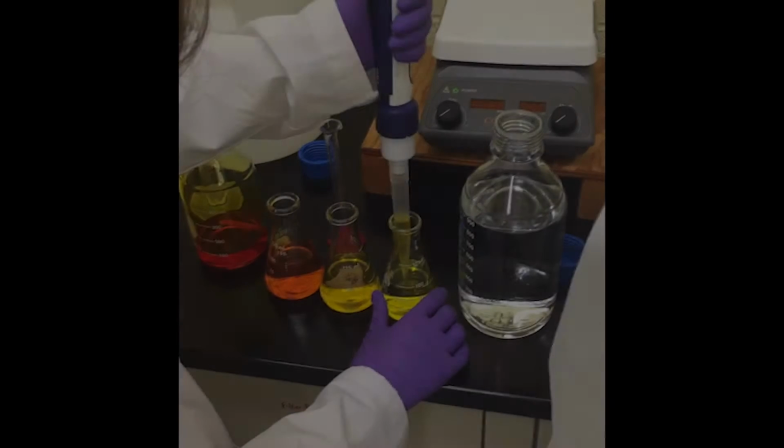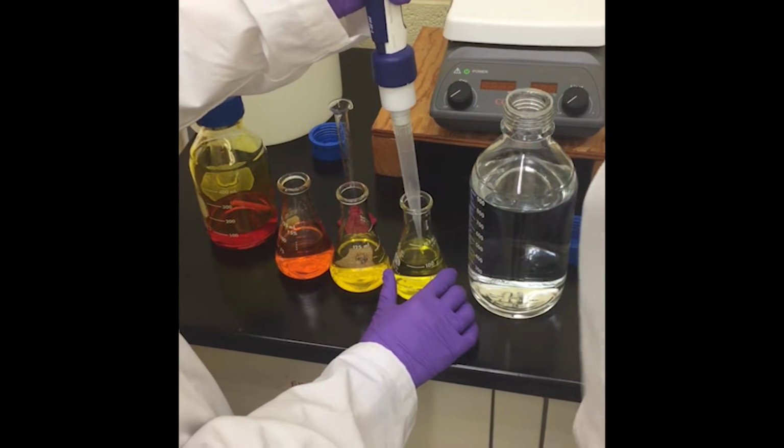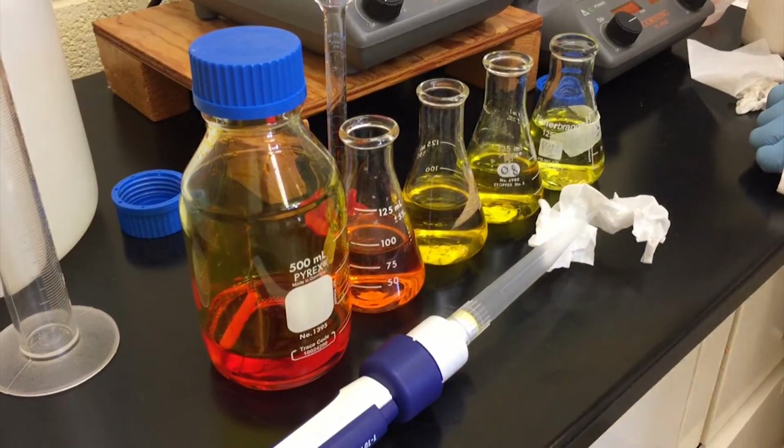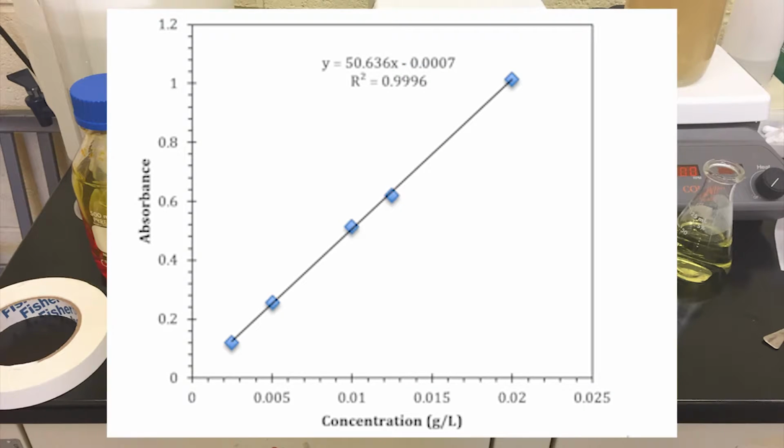To calculate the concentration of tartrazine dye released into the water bath at a specific time in the experiment, a calibration curve was created using known dilutions of the tartrazine stock solution. Various dilutions were created until absorbance readings were measured on the spectrophotometer ranging from 0 to 1 to demonstrate a range of viable concentrations. Using these readings, a linear trendline was generated, enabling us to directly relate the measured absorbance of the beaker solution to the tartrazine concentration.